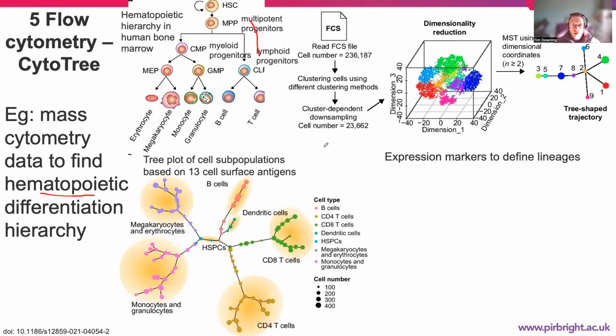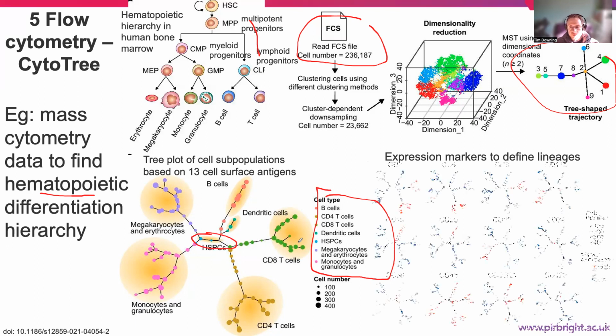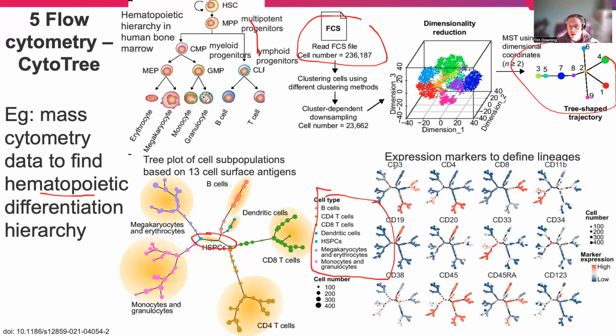Then here we've taken our data of the different cells, transformed it in an appropriate manner, looked at the dimension reduction approaches, created a minimum spanning tree to represent them, and then with known markers, labeled the different cell types here, as shown by this legend, where we have ones that are clearly identified as different, whereas there are some down here in the middle which are more difficult to distinguish. And therefore, we can also identify what markers are most associated with the different cell types and see how they differ as we go along.